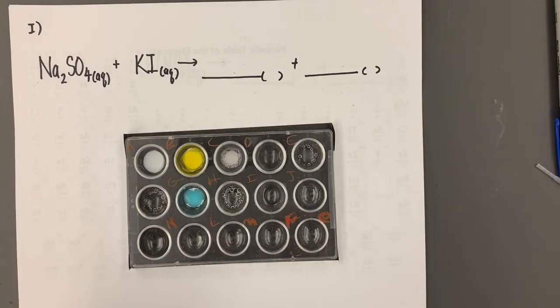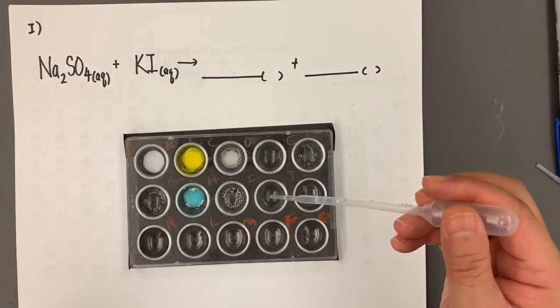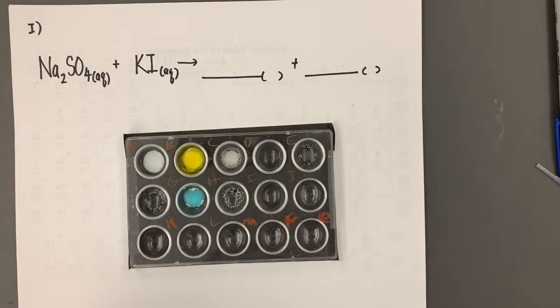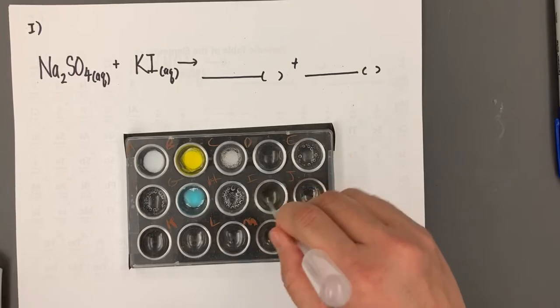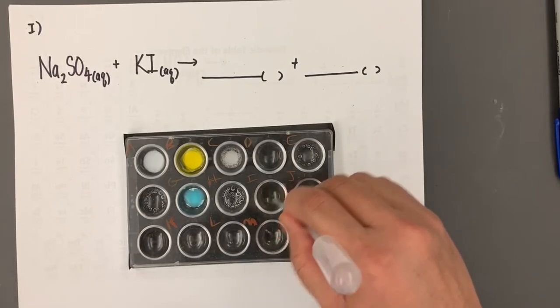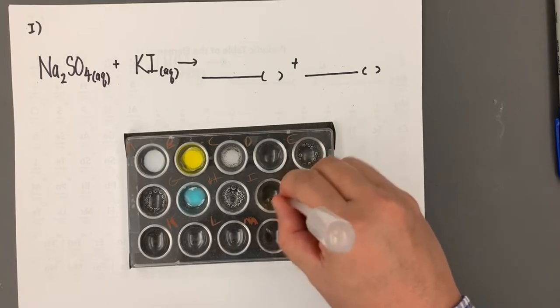We're going to go ahead and mix that together. I am mixing very vigorously, and I am not seeing anything happen.